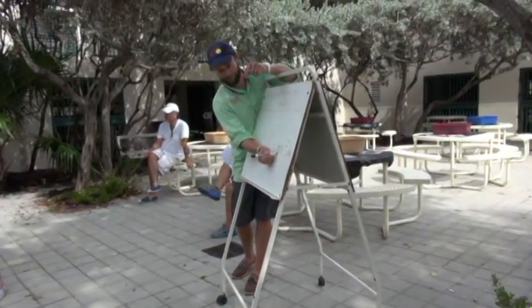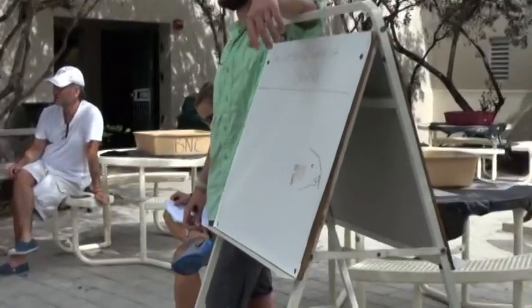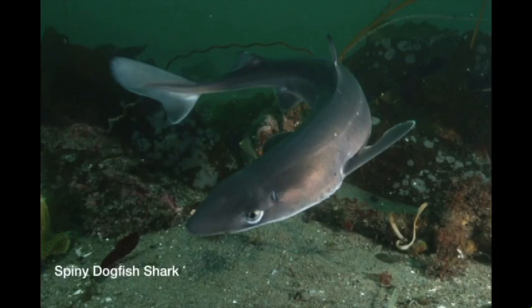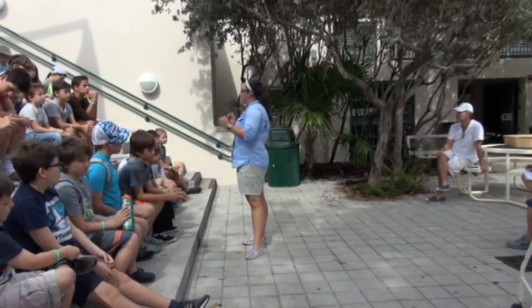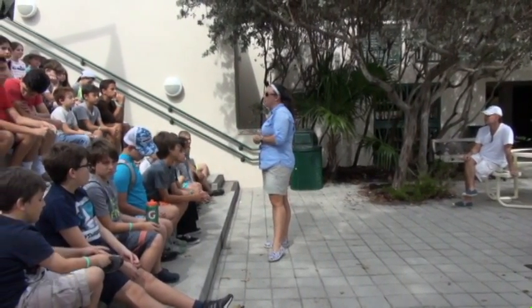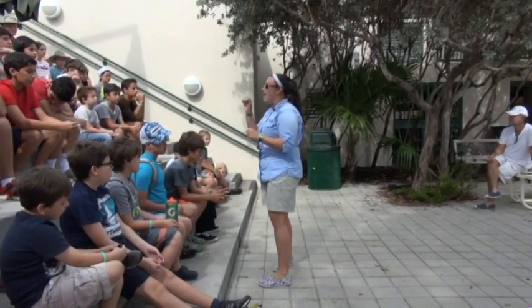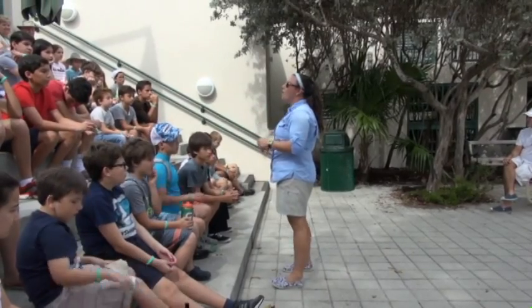Now, there are some sharks just like this guy we're going to cut open today. The guy that we're going to look at is known as a spiny dogfish shark. But also any bottom-dwelling sharks, sharks that live at the bottom of the ocean floor. These guys, if they had to continuously swim, what do you think would happen to the bottom of the ocean floor? If you're a shark hanging out at the bottom, looking for food and trying to be stealthy and trying to ambush your prey, if you had to continuously swim, what would happen to the bottom?